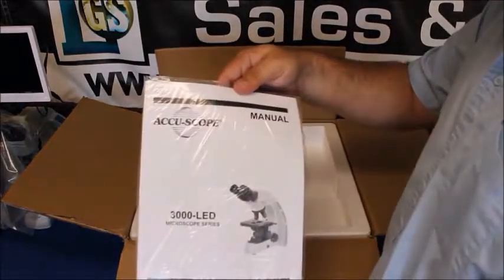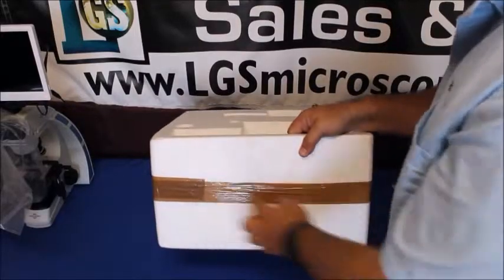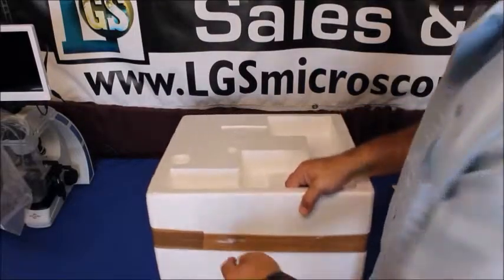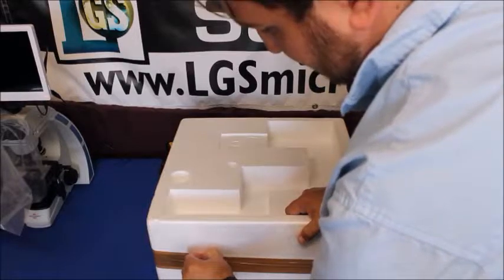Here you're going to have your manual and this is taped together so be careful. Okay, now you've got some tape around the edge here and you might want to cut it but it's actually easier to just grab the beginning of the tape and peel it off. There we go.